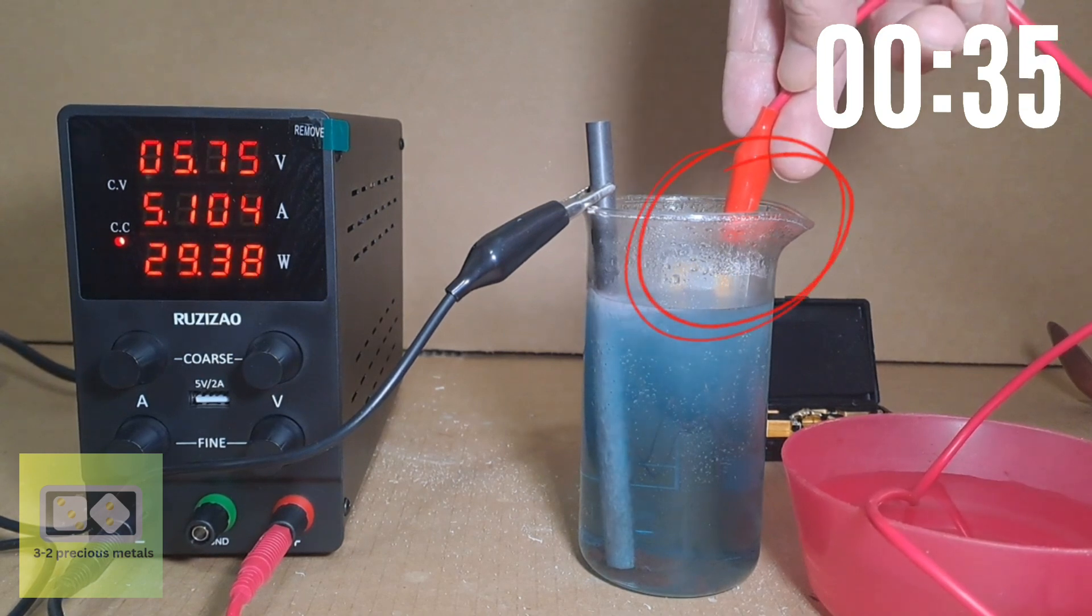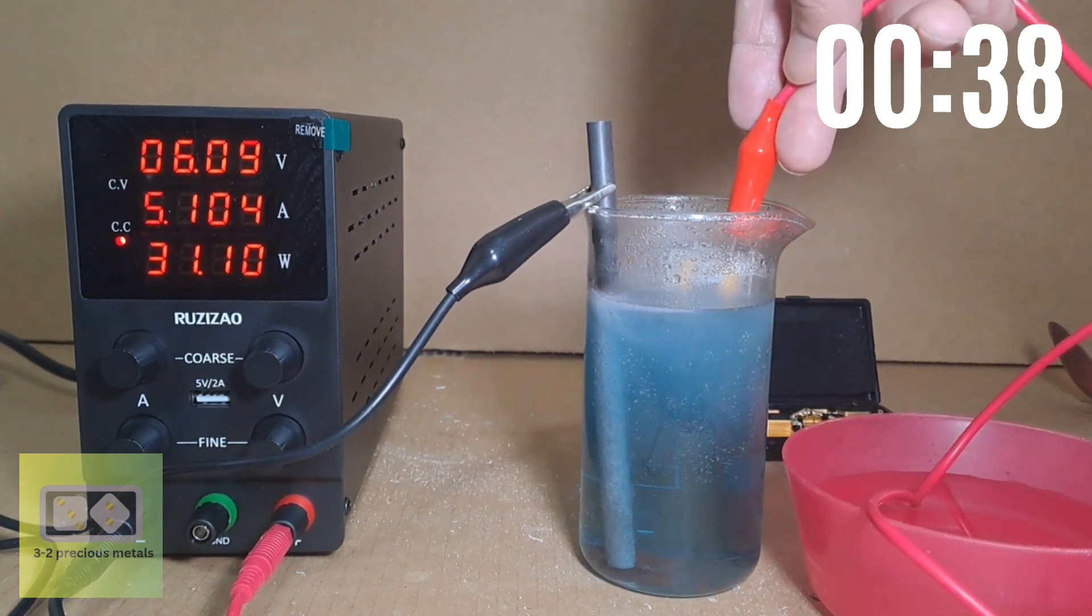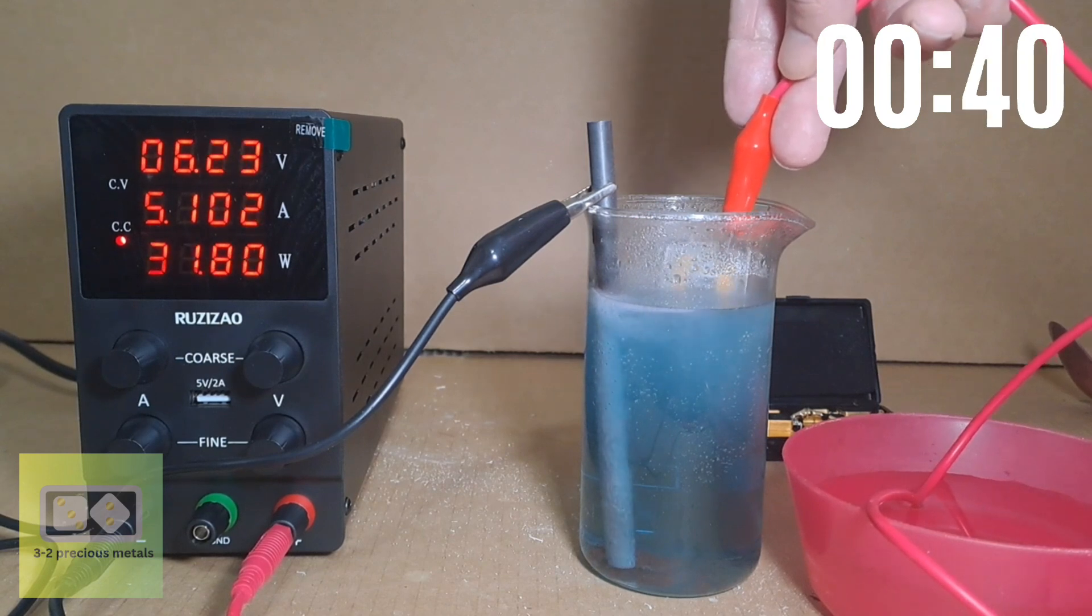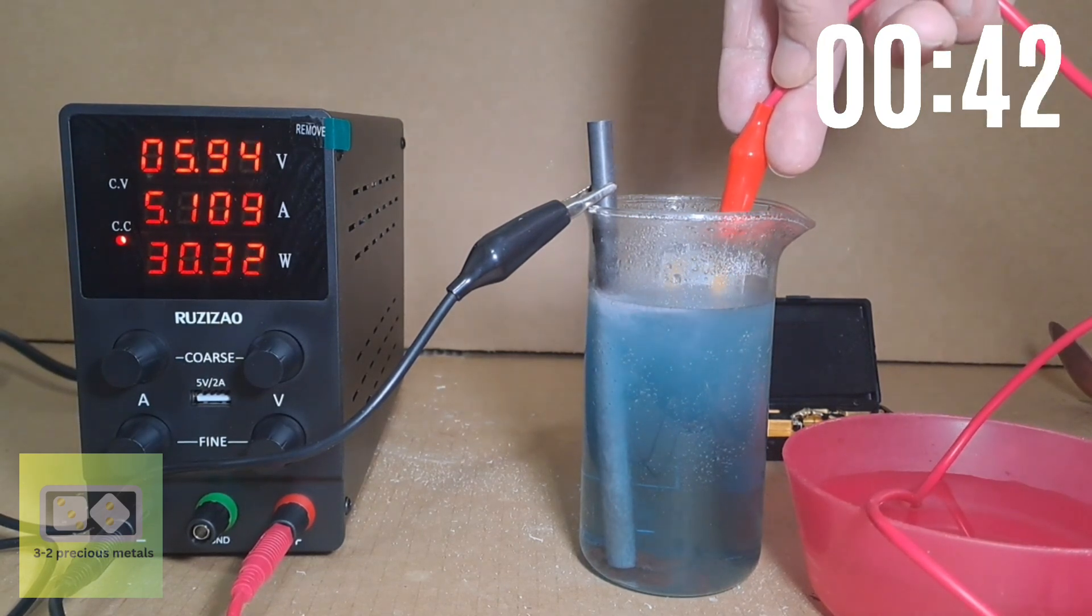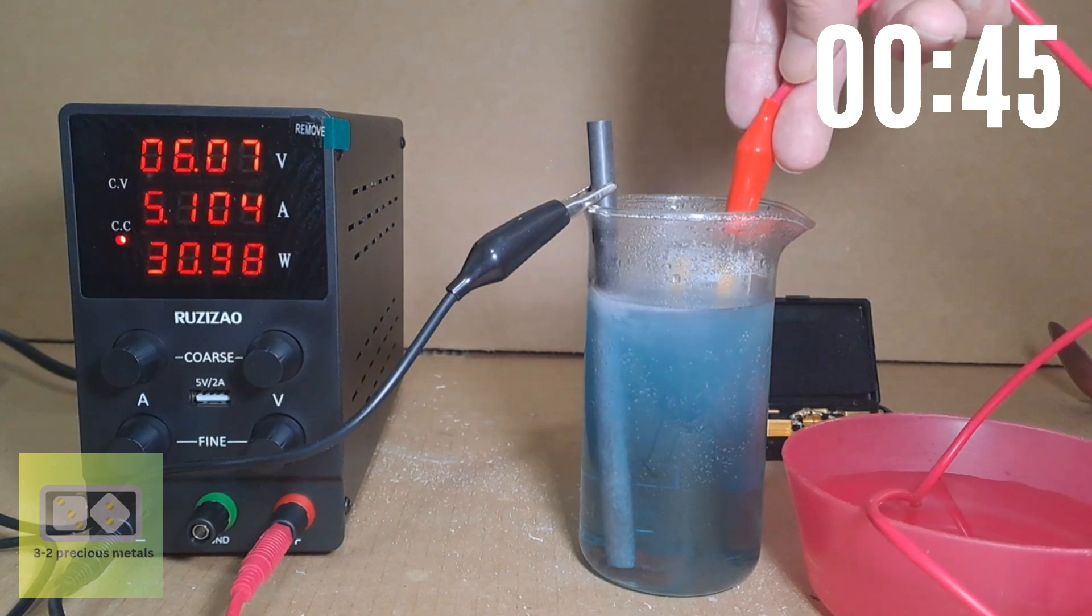The positive wire is attached to the anode. The anode is the piece that we are trying to remove the gold from. In this case it is a heat sink from an old computer processor.